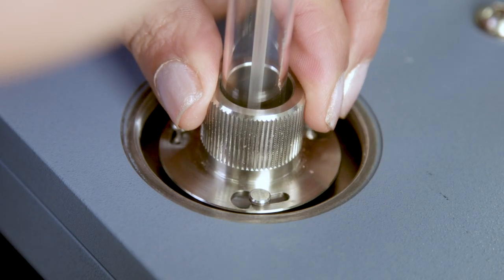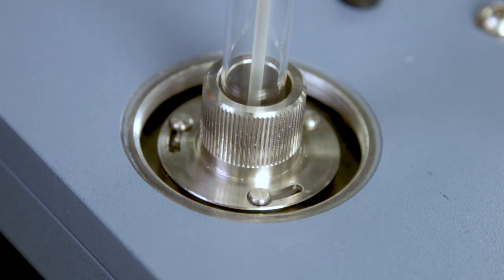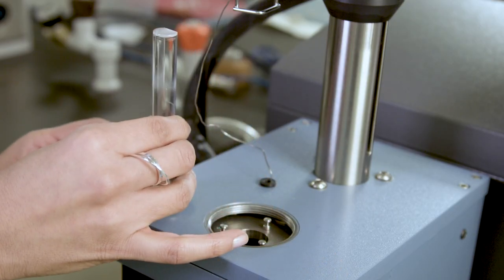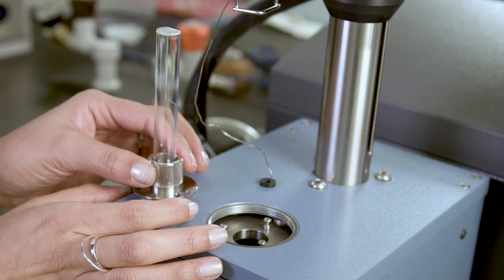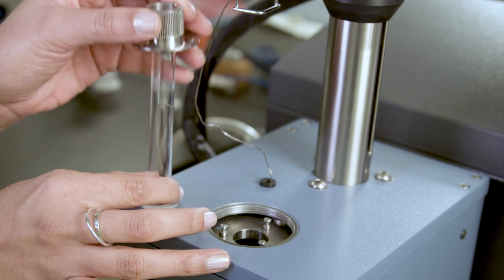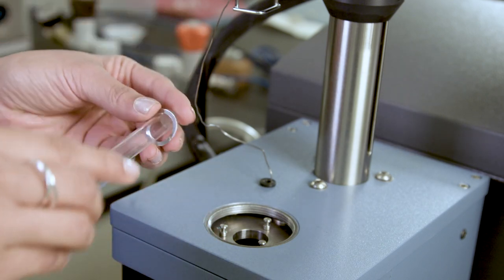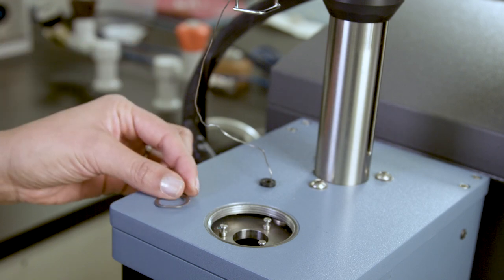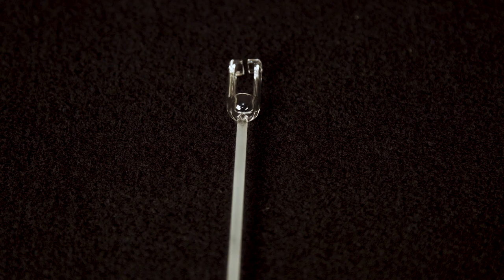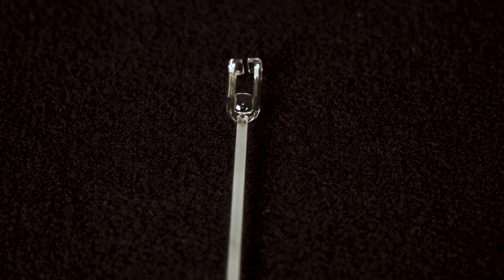Twist the stage retainer ring counterclockwise. Pull it up off the three posts and slide it up off the stage. Take the wave washer up off the stage flange and remove it.